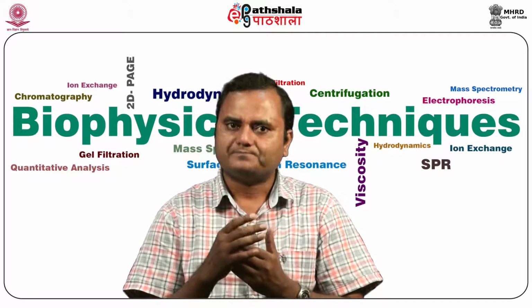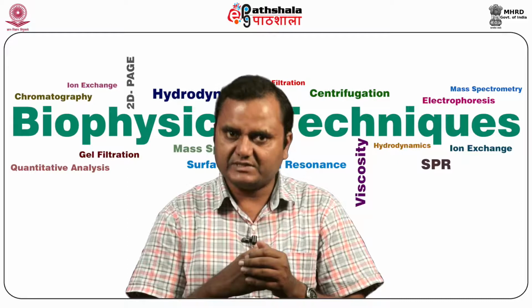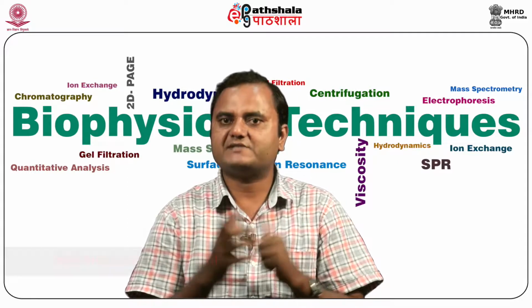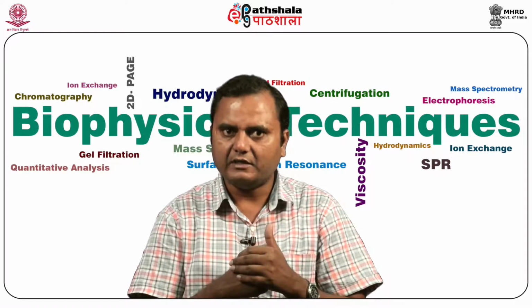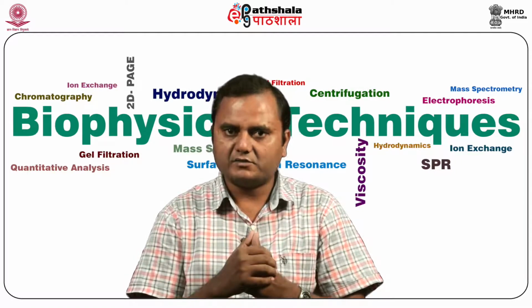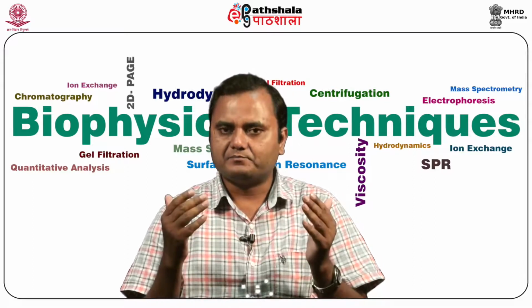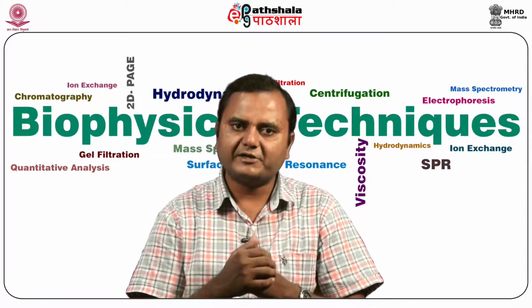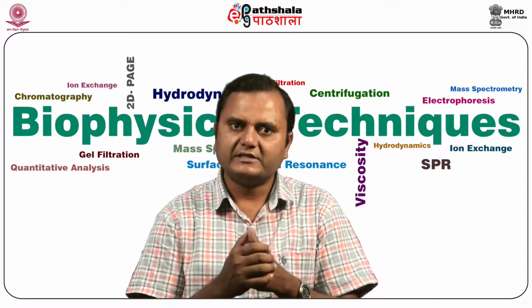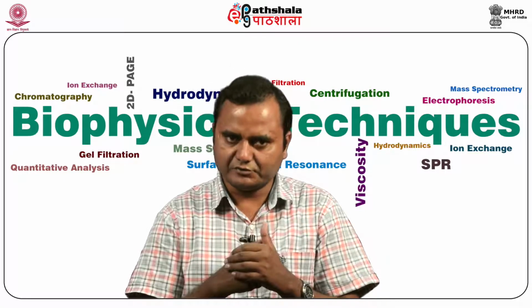Before that, I will give the idea that it is precisely used for the determination of the sedimentation coefficient, which measures the size of the particle, molecular weight of the molecule, molecular shape of the molecule, and molecular interactions such as protein-protein interaction, protein-ligand interaction, protein-DNA interaction. All kinds of interactions can also be measured using the ultracentrifuge.